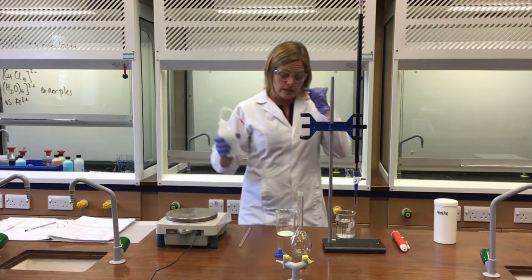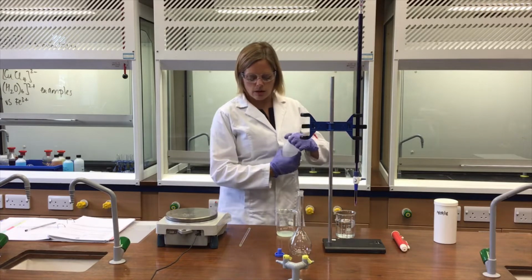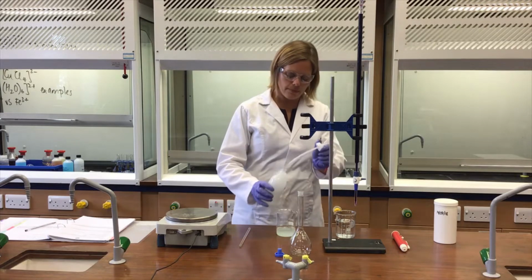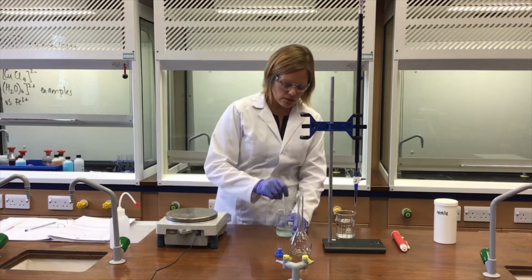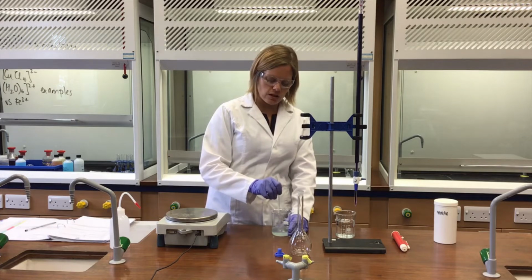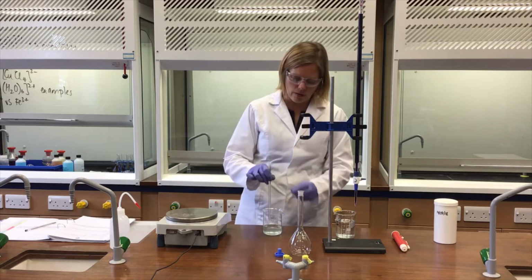I'm going to start off by dissolving this in some distilled water. So add some distilled water, about 100 centimetres cubed or so. I'm actually going to take the top off here, being careful not to pollute the stem by holding onto it, and just pour it in because it's a lot faster. And pop that back on there so that it doesn't get contaminated in any way. Take a clean glass rod and stir it. So I'm adding distilled water and stirring until all of the solid has dissolved. It's important to stir until all that solid has dissolved. Okay, that looks like it's all there.